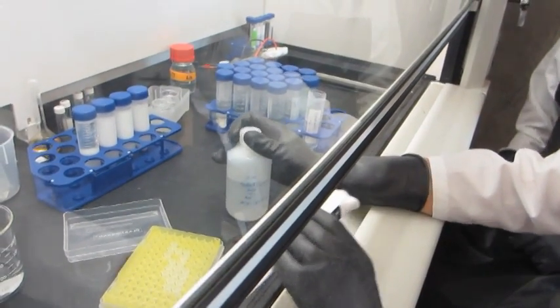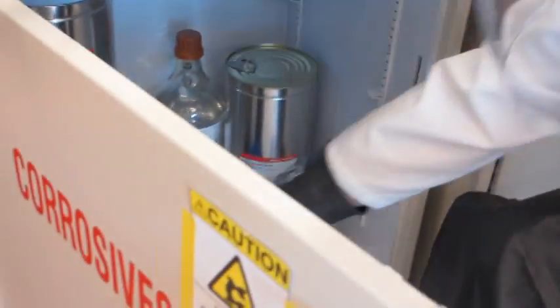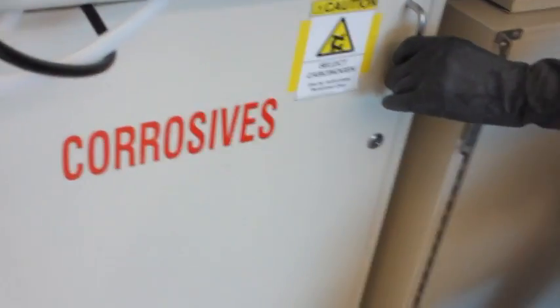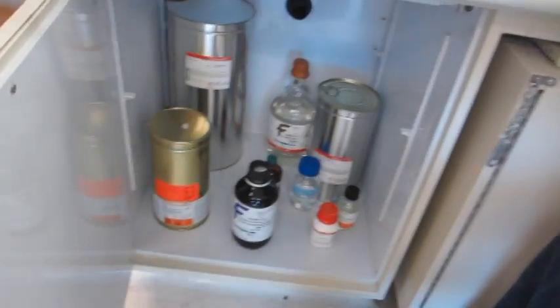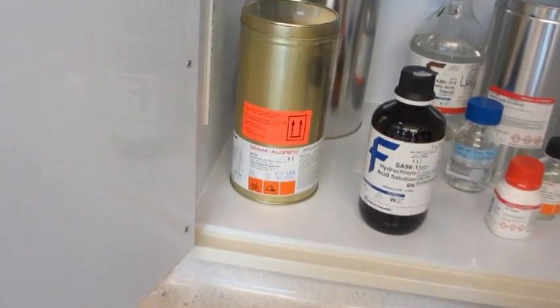When you're finished, store the chemical in a tightly closed container. Place the container below eye level on a non-corroding shelf, preferably in a corrosive or acid storage cabinet. Remember to separate acids from bases and segregate oxidizing acids from flammables. Also, double check that all containers are labeled.